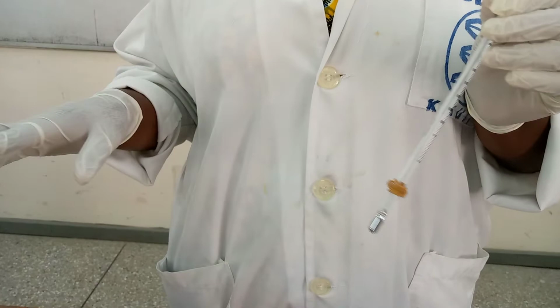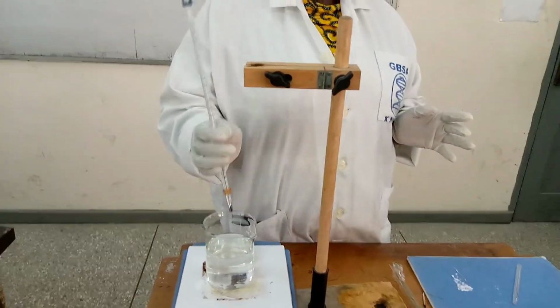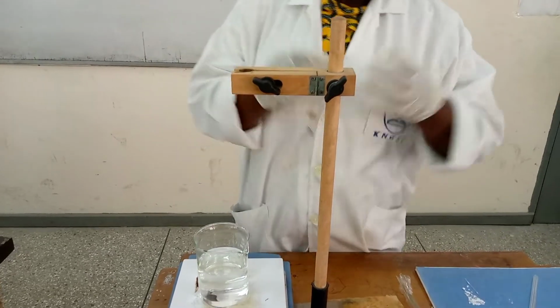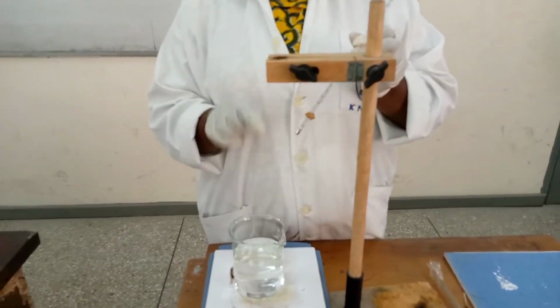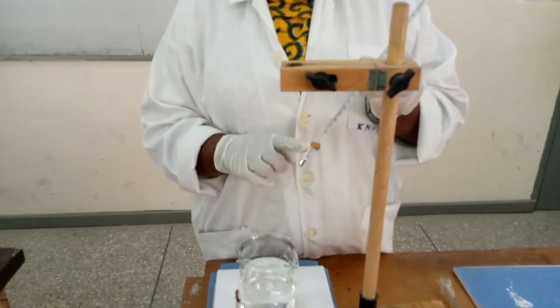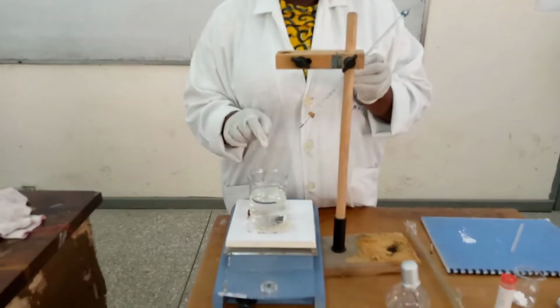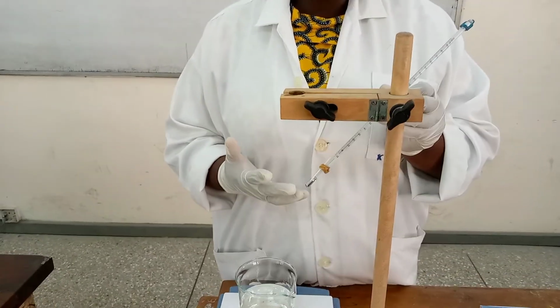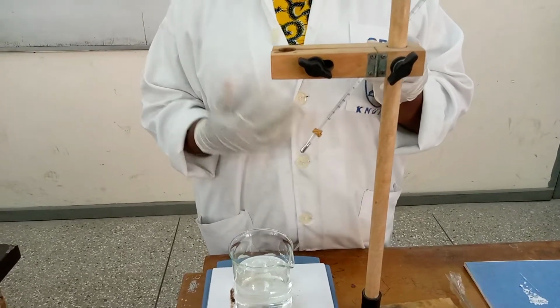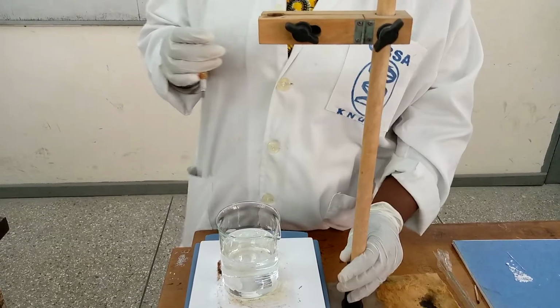Now my oil has been heating for some time. So I'm going to clamp this, then drop it into the paraffin oil. The rubber band is not supposed to touch the oil, because when it touches the oil it will melt, and when it melts the sample will drop into the paraffin oil and you will not be able to determine its melting point. It means you have to start the process all over again. So when you are doing it, you have to be very careful.